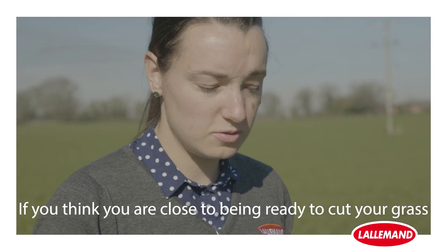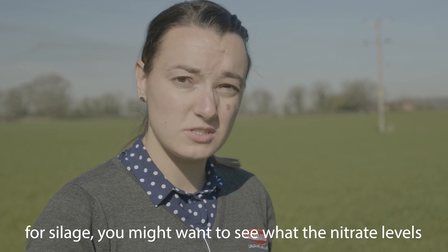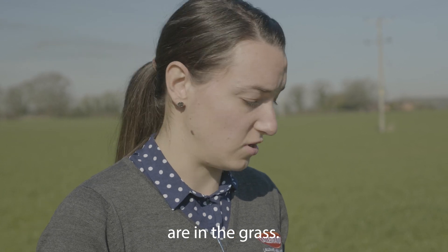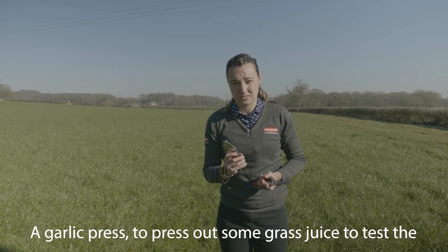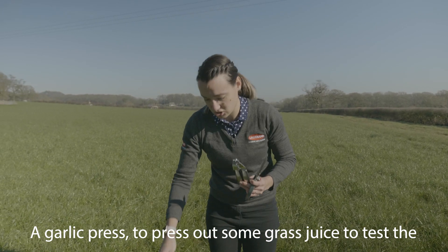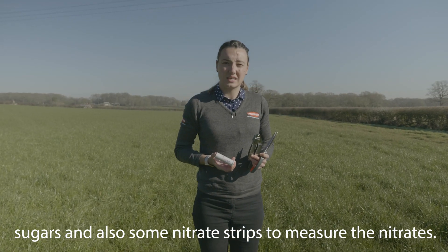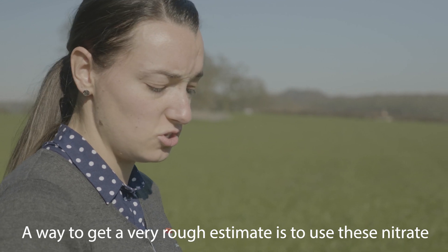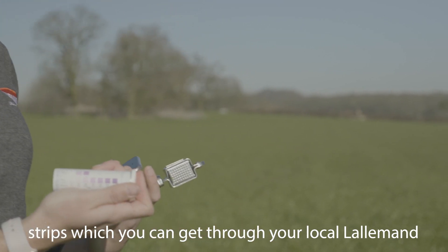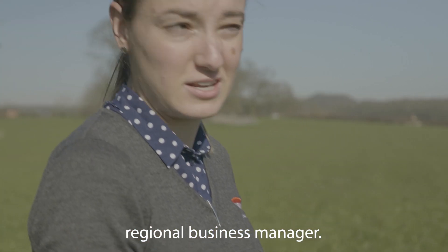If you think you are close to being ready to cut your grass for silage, you might want to see what the nitrate levels are in the grass. Use a garlic press to press out some grass juice to test the sugars, and also some nitrate strips to measure the nitrates. A way to get a very rough estimate is to use these nitrate strips, which you can get through your local Lallemand regional business manager.